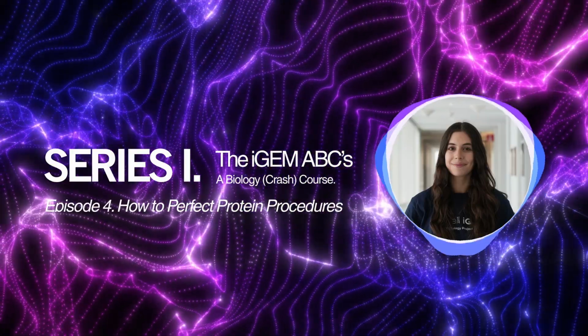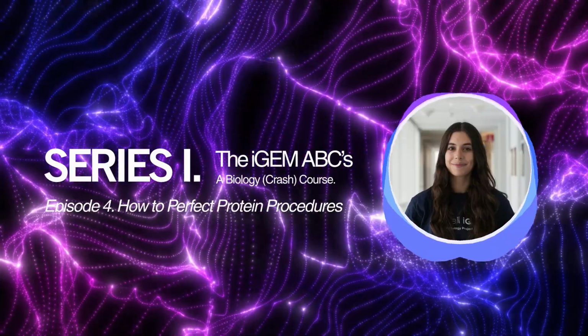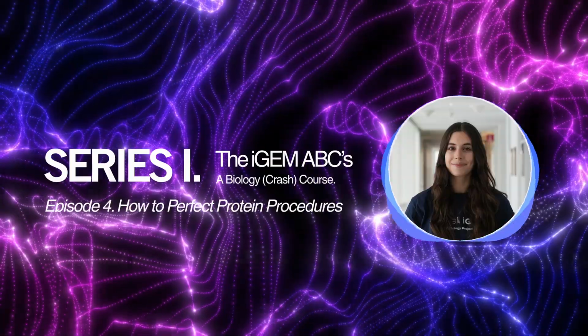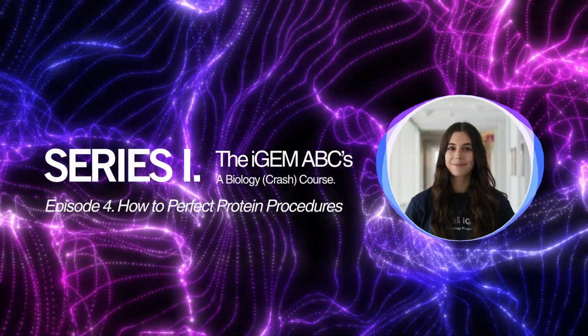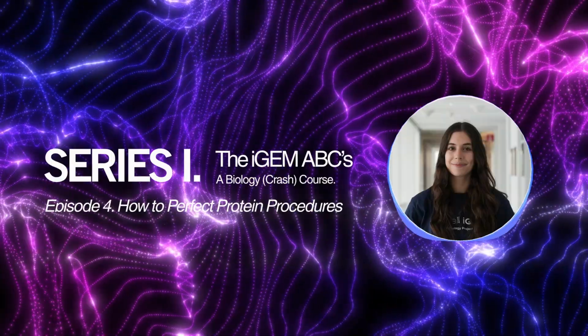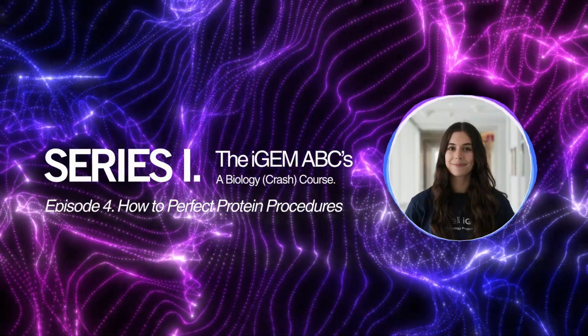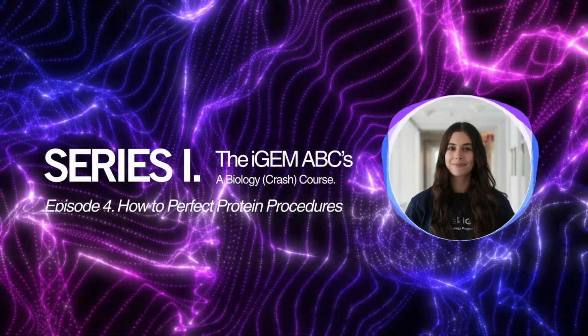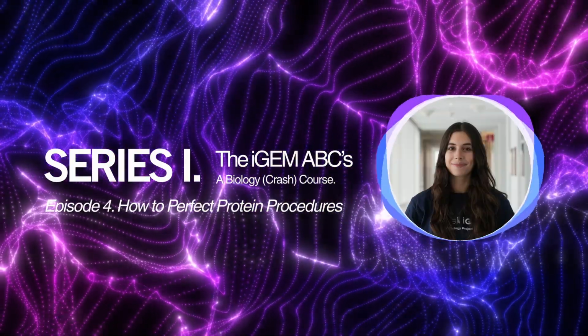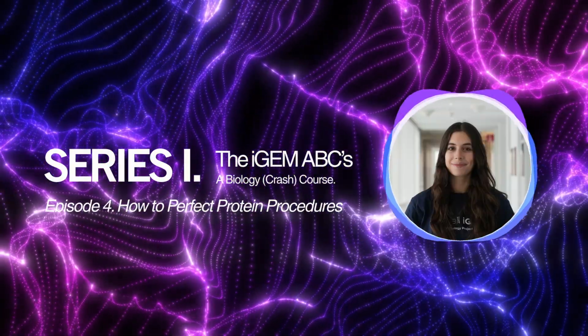This is often done using sonication, where the pellet is suspended in some sort of stabilizing lysis buffer, and a sterile probe that emits high-frequency sound waves is submerged in that buffer. These sound waves provide enough energy to break apart the cell walls. The caveat is that they can also provide enough energy to heat up and denature your protein, so sonication has to be done carefully.